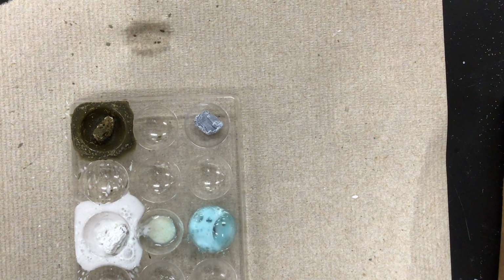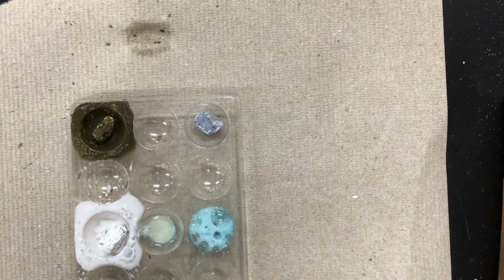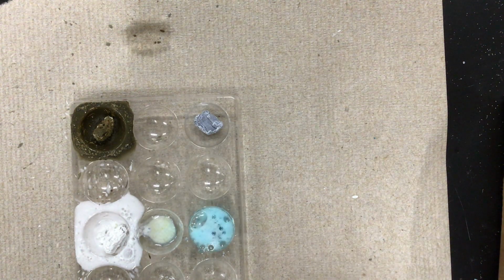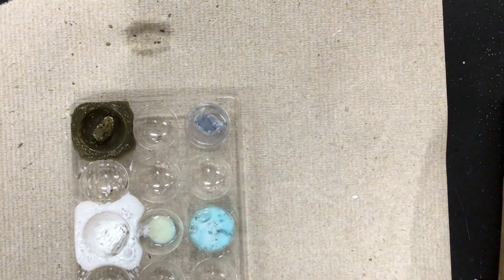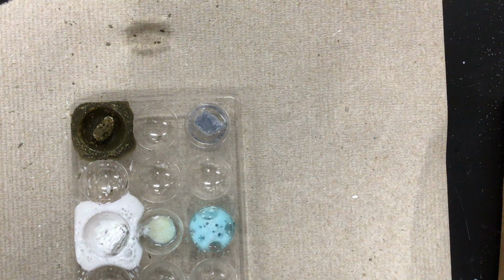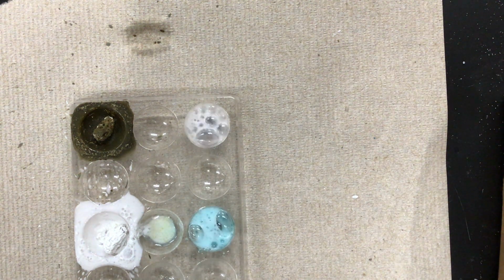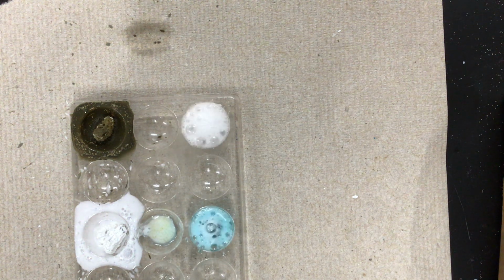All right, and while that's going, I'm going to go ahead and move on to our next solution. So our fourth solution is the hydrochloric acid. So let's see how calcium reacts with the hydrochloric acid. So this one is very violent as well. This one got going pretty much right away.